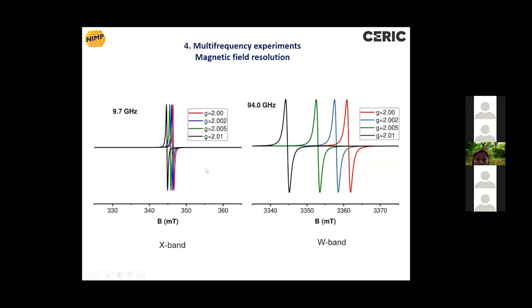So these spectra have the same g value, and the field range is the same in both graphics, 40 millitesla.